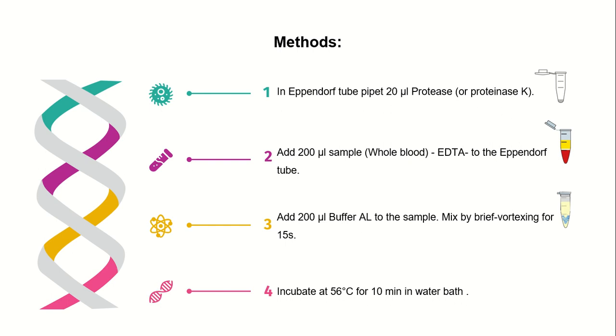Then we will mix them for 15 seconds to be sure all the components are mixed together.